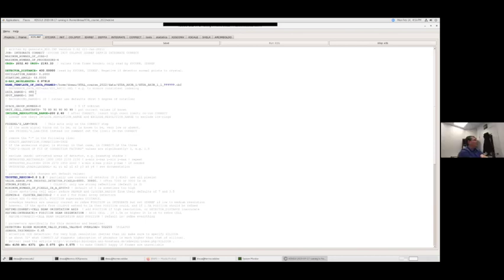Right. And the way you do that, again, we're back on xds.inp. You just go to data range here, right? So if I decided this data set had 600 frames, and after 480 wasn't any good, I can say 1 to 480. Now, if I save and rerun, it'll only do those 480.